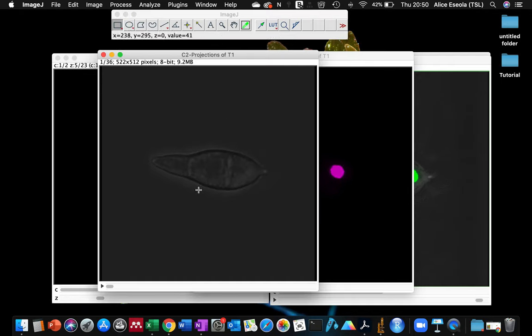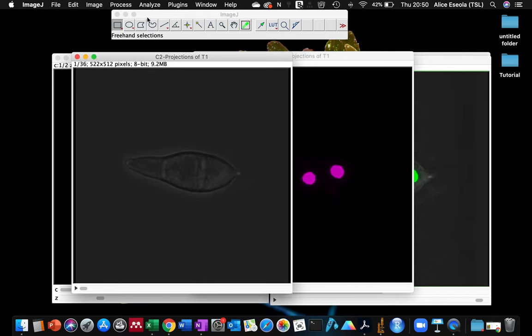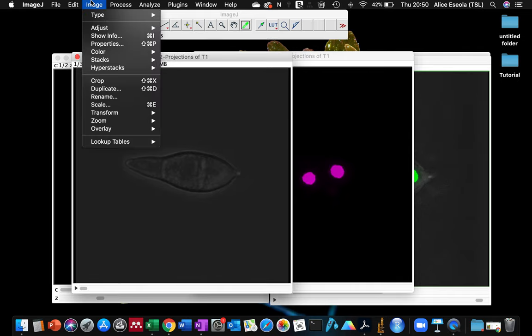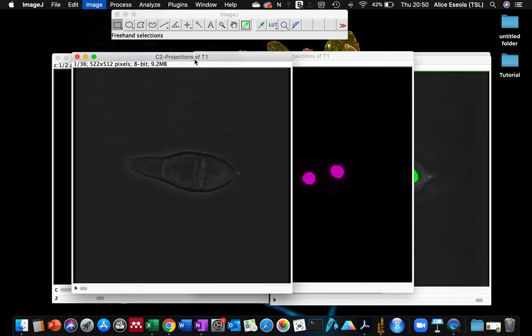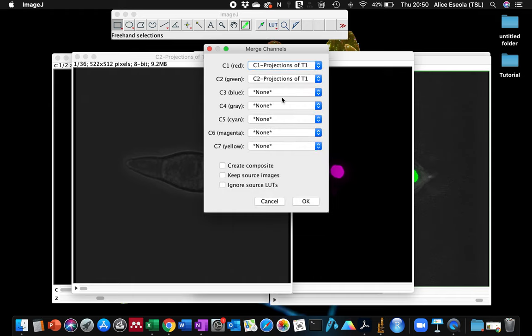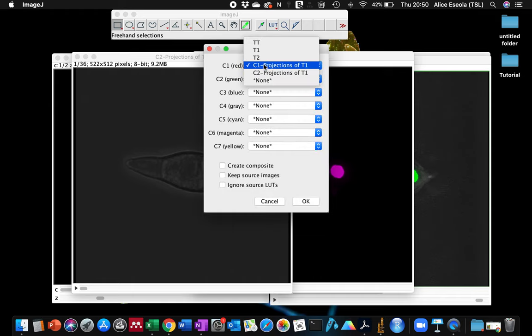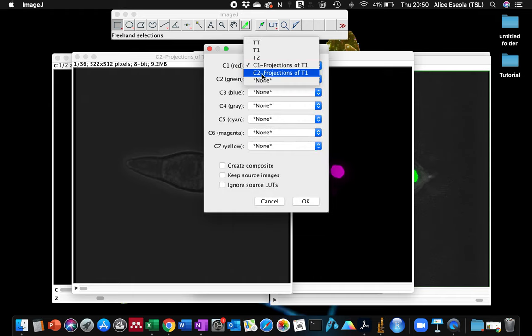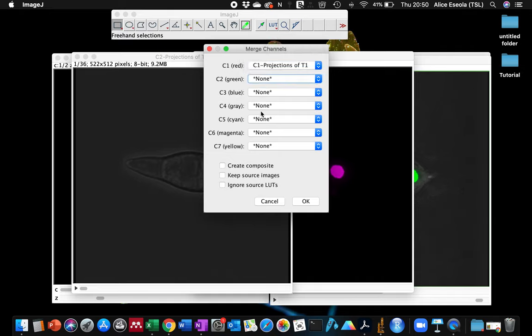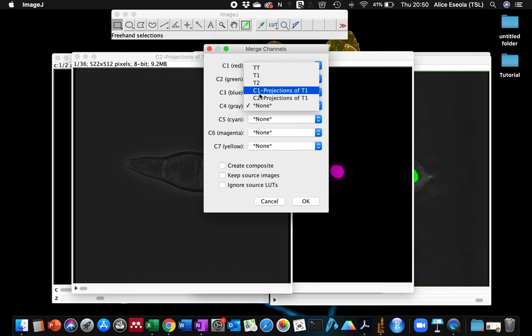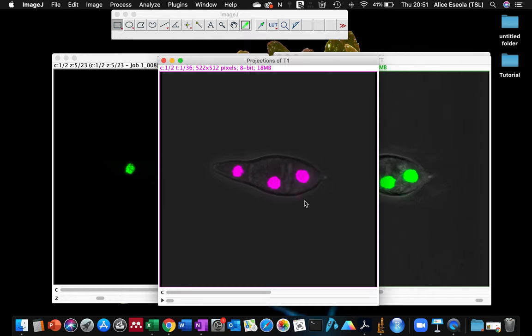And we have here our brightfield channel. Then we go to Image, Color, Merge Channels. So we're going to merge them together. The red channel is the magenta so I'm going to leave it as the C1 and we don't have a green here. And our gray channel is the brightfield channel. We click OK.